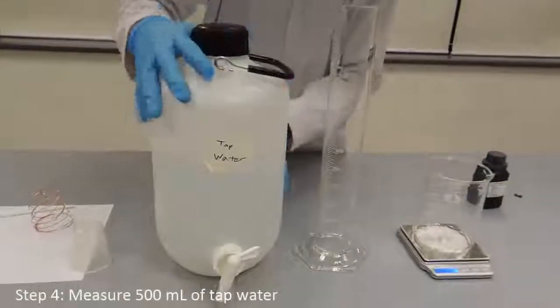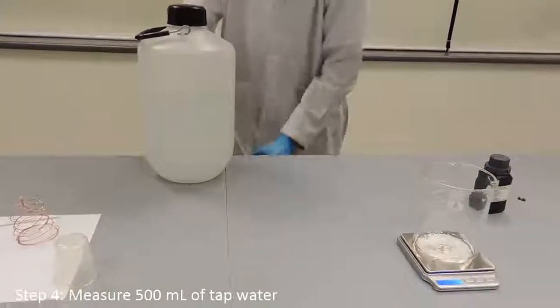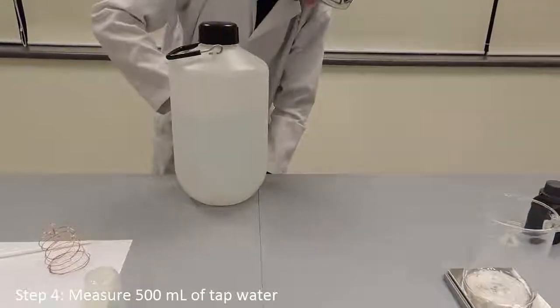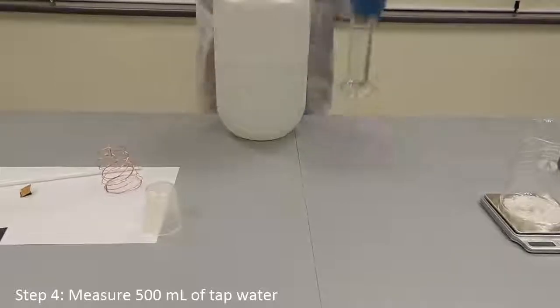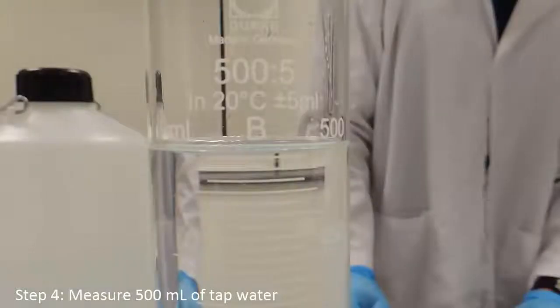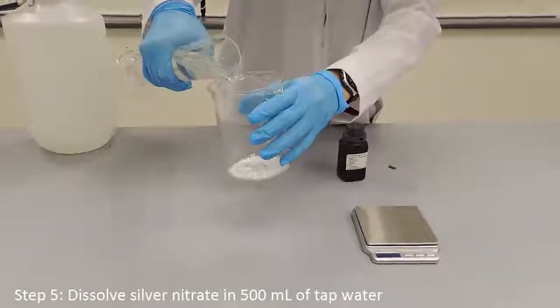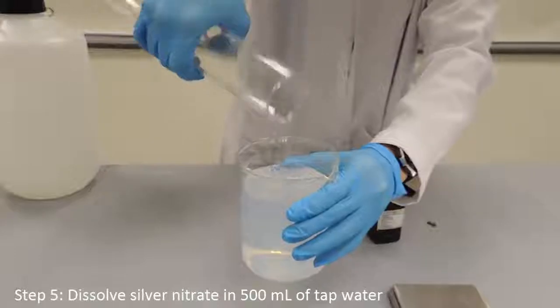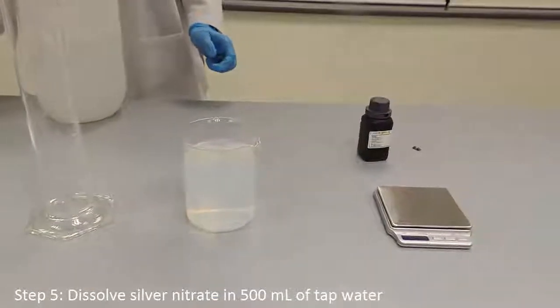The fourth step of the experiment is to measure 500 ml of tap water into the measuring cylinder. The fifth step of the experiment is to dissolve silver nitrate in 500 ml of tap water. This step is to make a silver nitrate solution of 0.1 molar concentration.